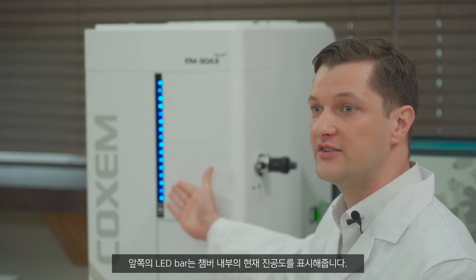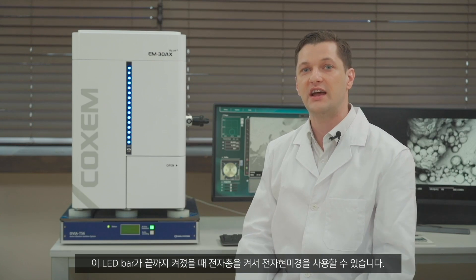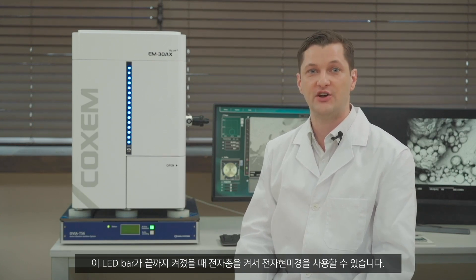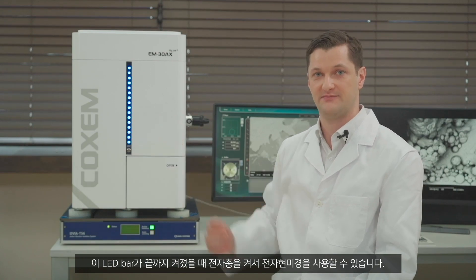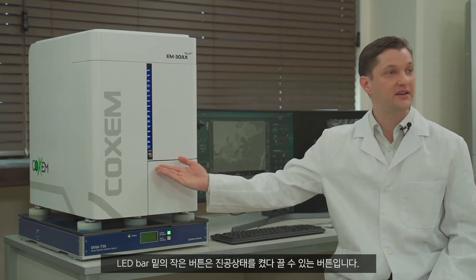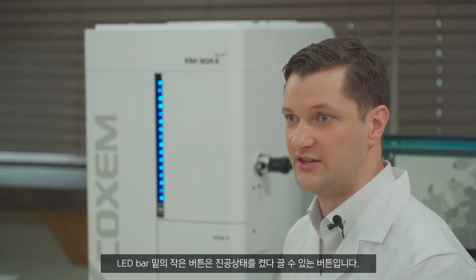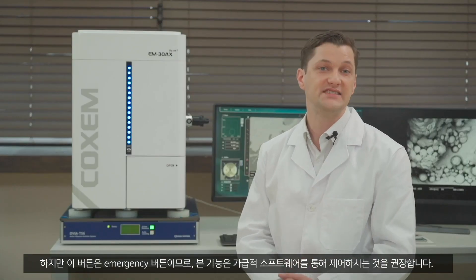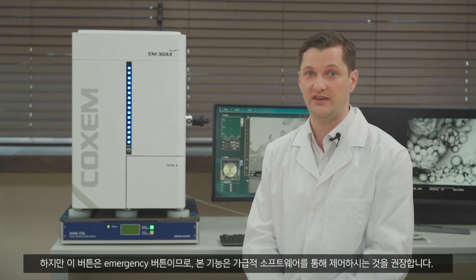The LED bar in front shows the level of the vacuum inside the chamber. The electron microscope can be operated by turning on the electron gun when this LED bar is fully lit. The small button under the LED bar can be used to turn on or off the vacuum. However, as this is an emergency button, it is recommended to control the vacuum via software.